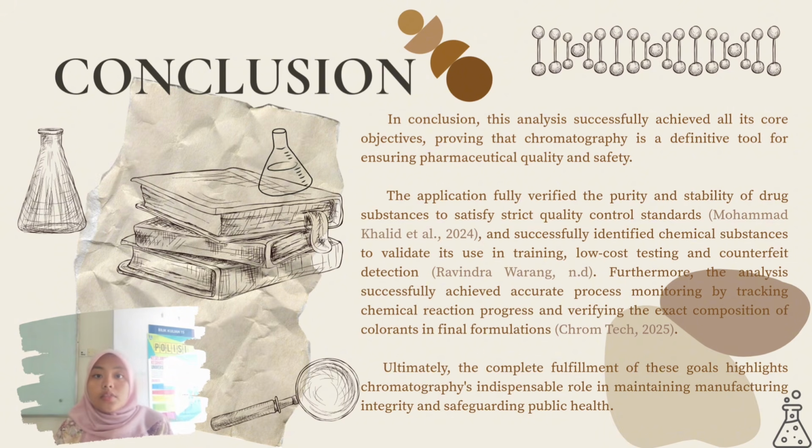Furthermore, the analysis successfully achieved accurate process monitoring by tracking chemical reaction progress and verifying the exact composition of colorant in the final formulation. Ultimately, the complete fulfillment of this goal highlights chromatography's indispensable role in maintaining manufacturing integrity and safeguarding public health.